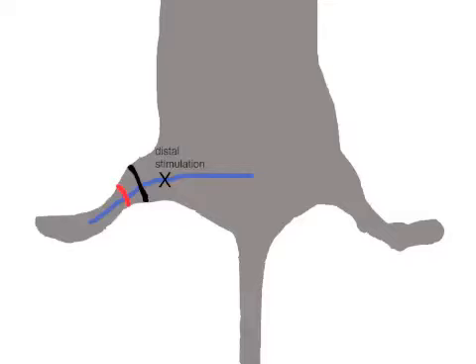Now the point of distal stimulation has to be marked. We arbitrarily chose a defined and constant distance of 4 mm.